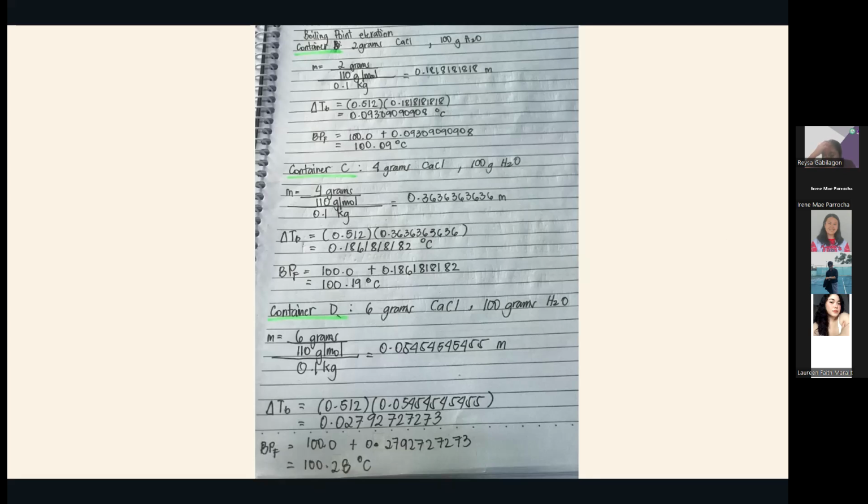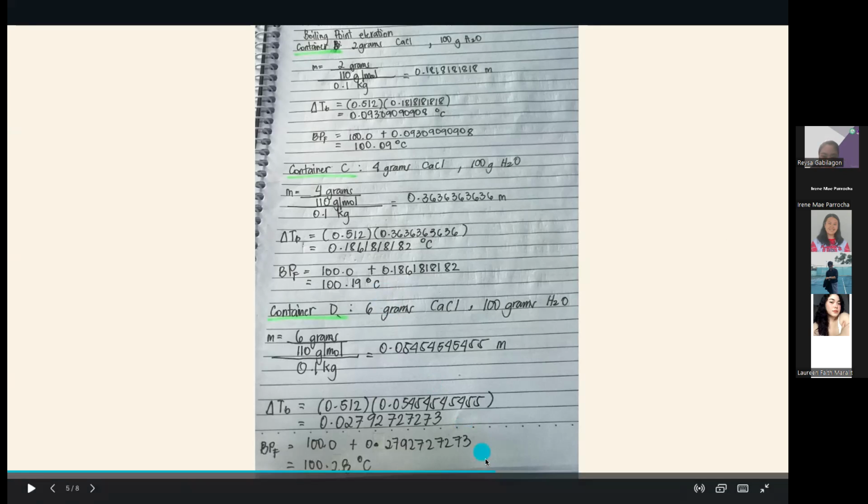There is an increase, but it's not really that big. So, kung hindi talaga natin siya masyadong mapapansin sa thermometer. Especially wala namang point yung thermometer na ginamit natin last time. Okay? So walang questions. So that's it for the report of Group 1. Thank you, Group 1.